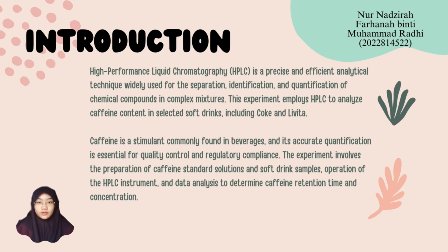High-performance liquid chromatography, or HPLC, is a powerful analytical technique used in chemistry for separating, identifying, and quantifying components in complex mixtures. It operates by passing a liquid sample through a column containing a stationary phase under high pressure, resulting in the separation of compounds based on their interaction with the column.